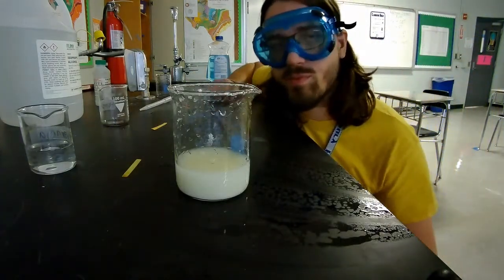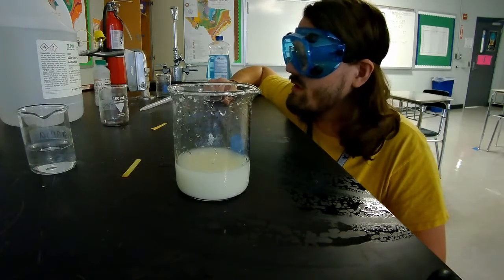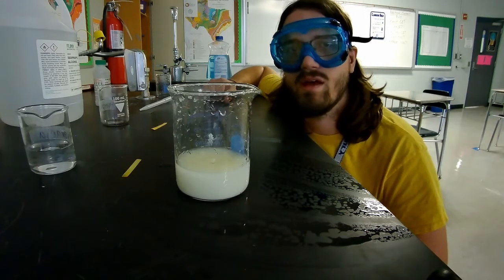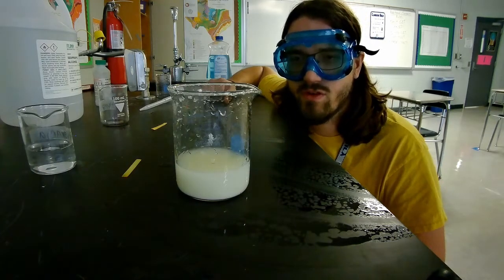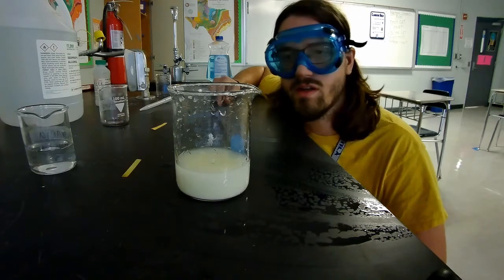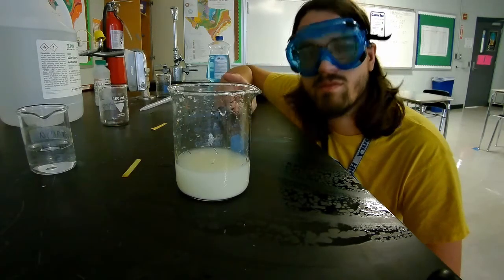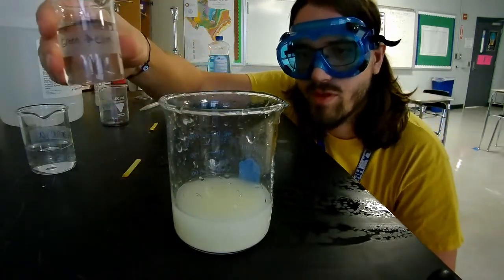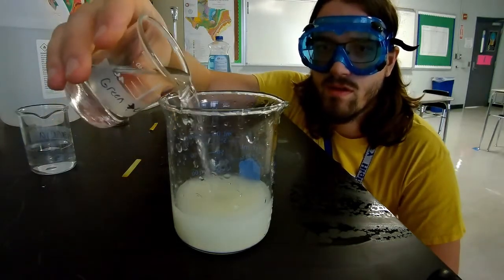Well, let's see. I've just spent most of the chemicals already. So we saw what happened with baking soda and hydrochloric acid and ammonia with hydrochloric acid. Let's move down the scale to some of our weaker acids and bases. So let's use our Tums, our calcium carbonate, and I have a whole bunch of vinegar. Let's see what happens between those two. Tums, calcium carbonate, and vinegar. All right, here we go. So we have a pretty weak base and a reasonably strong acid here. Let's see what happens.